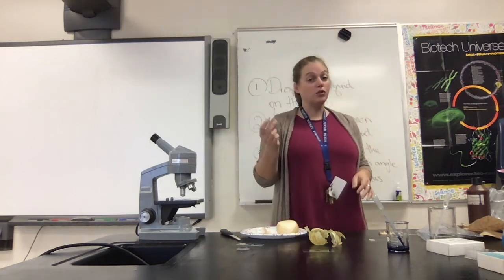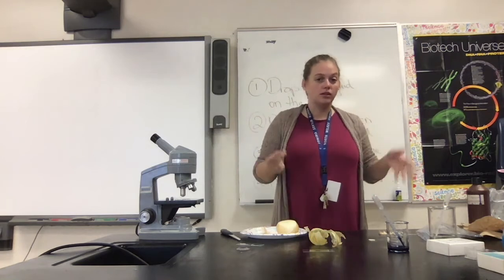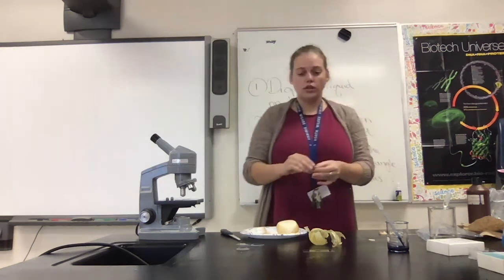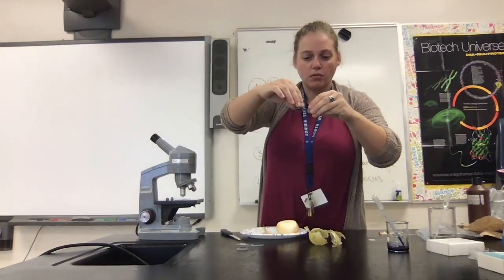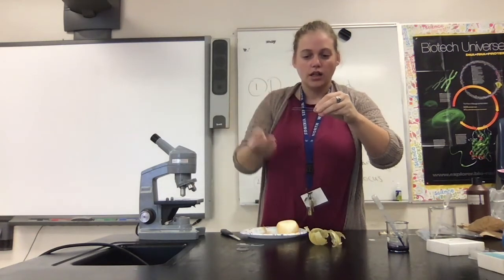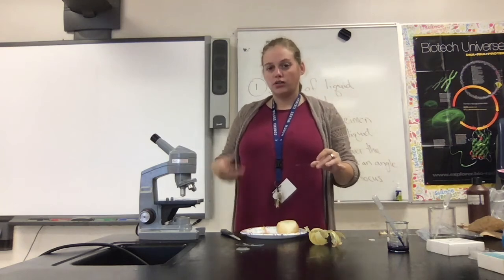And I'm going to take my toothpick and make sure that I throw it away because I don't want to leave something with saliva laying around the classroom. Once I've thrown away my toothpick, I'm going to take a cover slip and I'm going to drop that over my methylene blue at an angle and try to squeeze out all of the air bubbles. And then I can put this slide on the stage and go through my focusing routine to see these cells in low to high power.